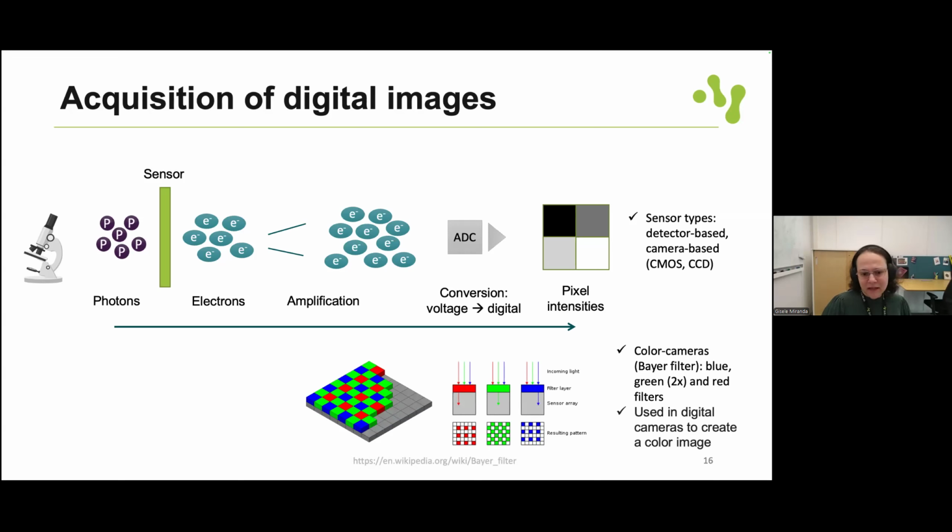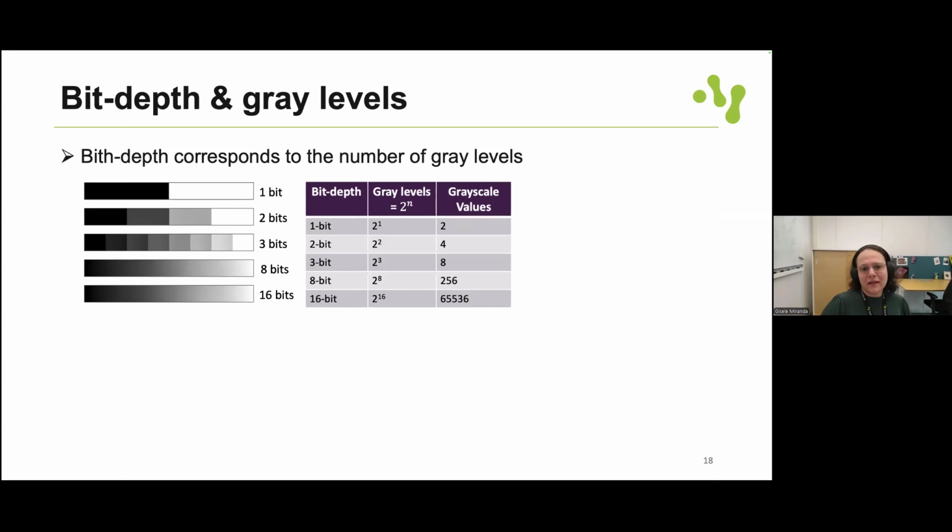And we can think in an analogous way for color cameras as well, as here the filter is now responsible for this conversion to the pixel intensities. Here we know that the green filter, for instance, is double the size of the red and blue filter, since the human eye can discern the green signal better. So this is the process of obtaining the pixel intensities, right?